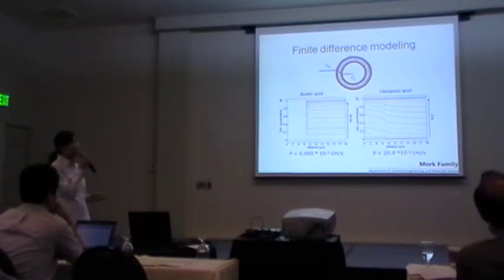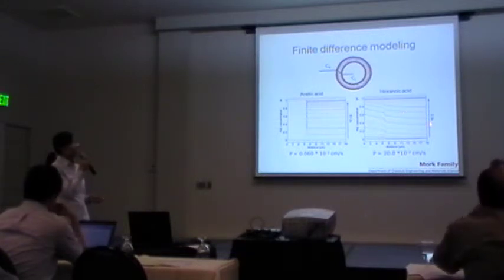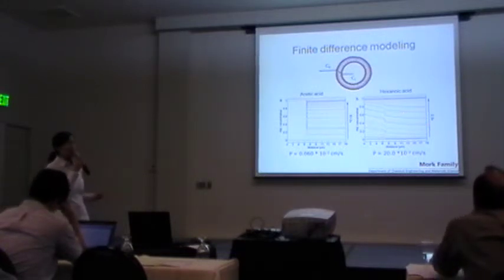We can see the permeation process of acetic acid takes much longer than hexanoic acid. For hexanoic acid, its internal acid concentration increased quickly as the outside concentration increased, while for the acetic acid, its internal acid concentration changes slowly after the outside concentration has already reached the maximum value.